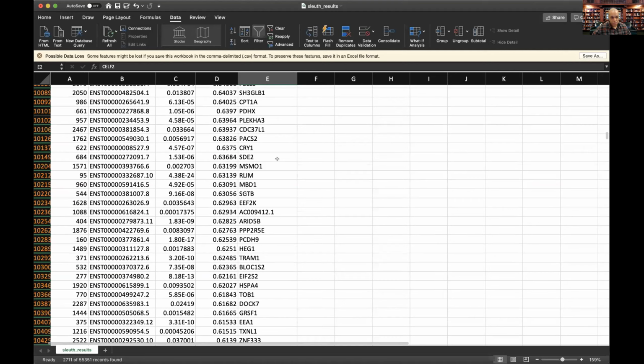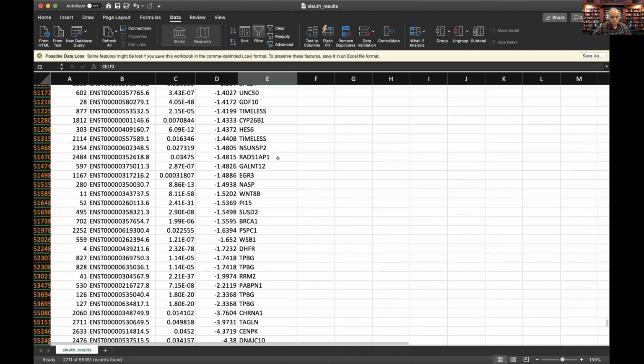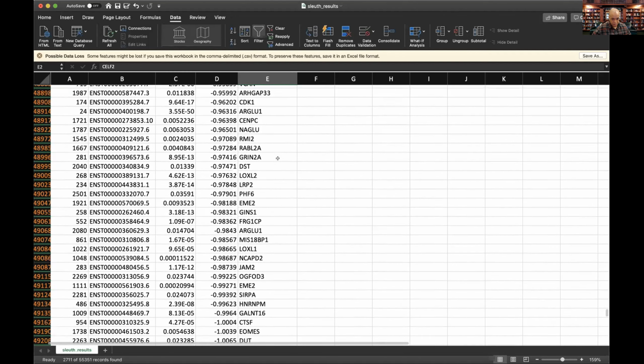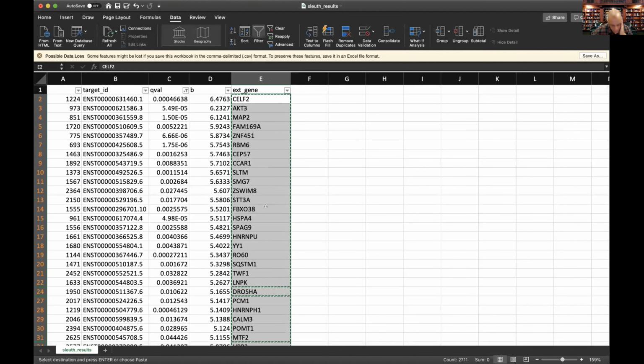Now, what I'm going to do is just take all of them, but you could take a subset. And oftentimes when you're a researcher, you may have an idea of certain genes you want to look at first, but for the fun of it, I'm going to take all of them, thankfully, because the service that I'm going to use is going to be quite fast, and see if we spot things where the sort of thing we're looking for is to say, are these genes overrepresented?